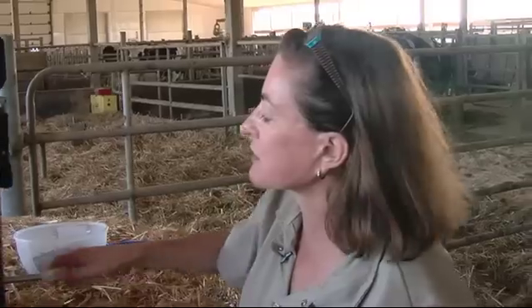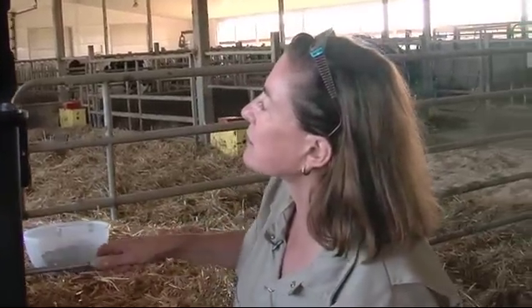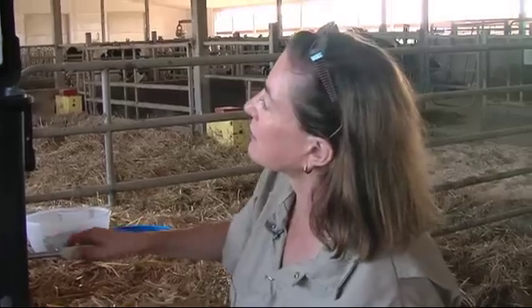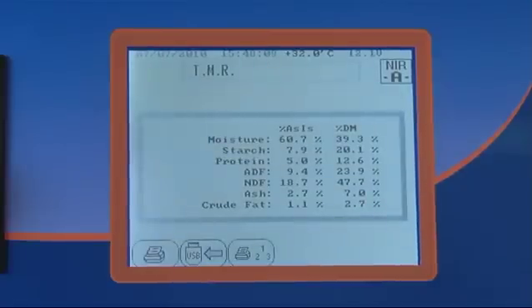We're doing three samples — the three analyses that will be averaged. I now have got my analysis.